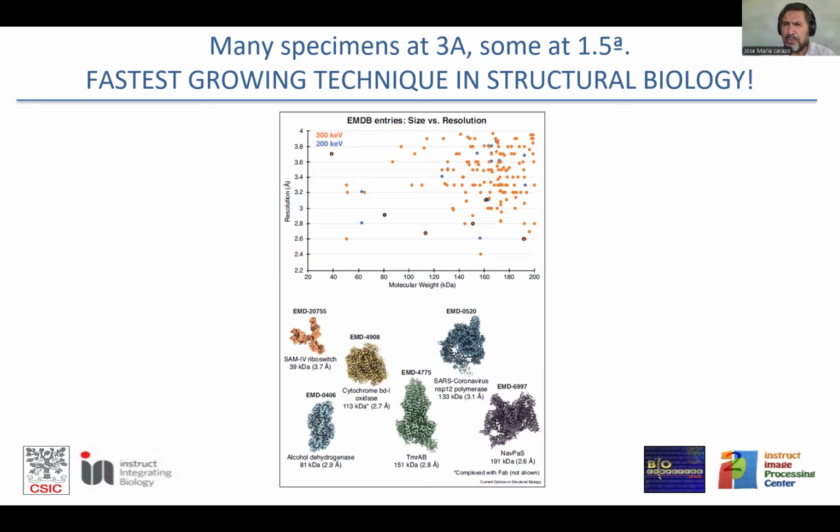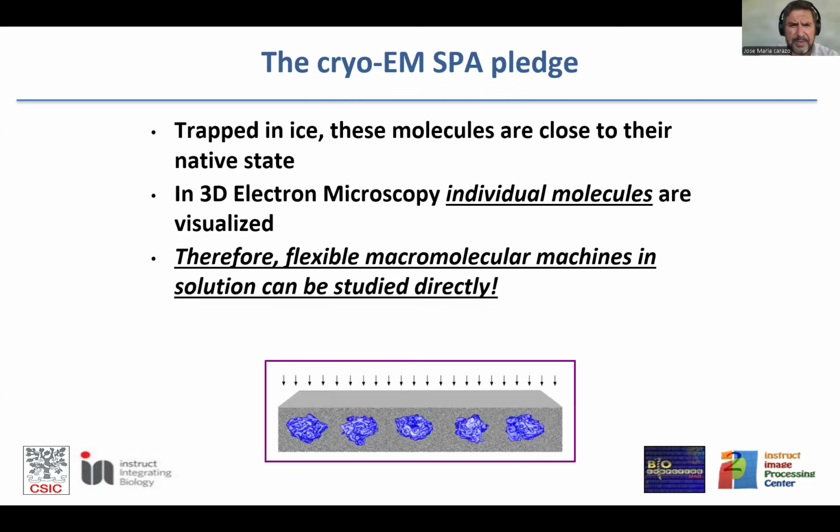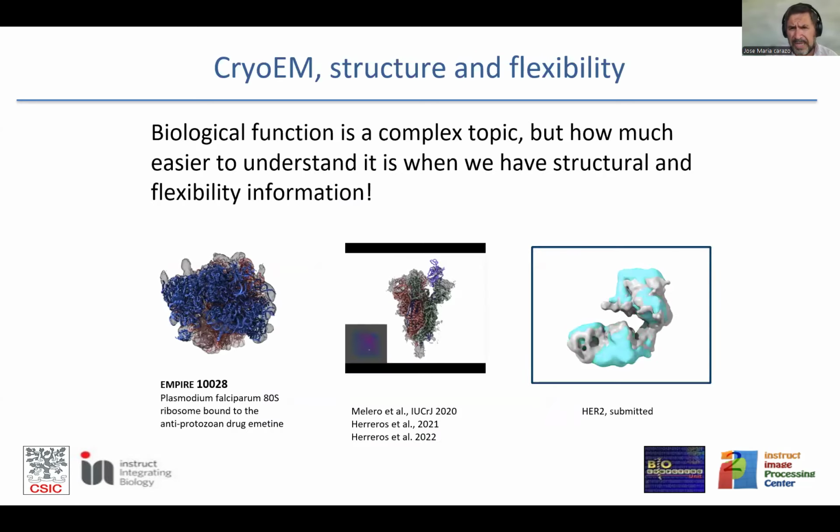and at the same time to get dynamics of the system. At this point, we are working on that with very interesting facts. So this is the recapitulation. And this is what I'm going to present to you in terms of research: to study the flexibility of these molecular machines in solution. And you have here a number of structures and really how they move. There are three systems.